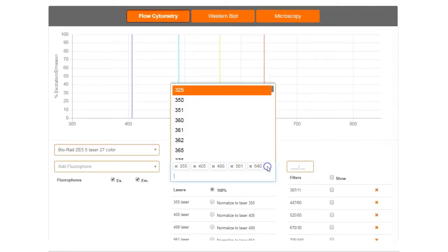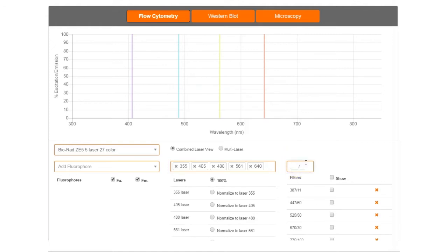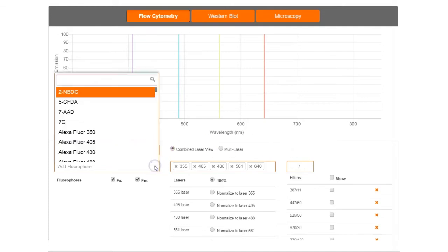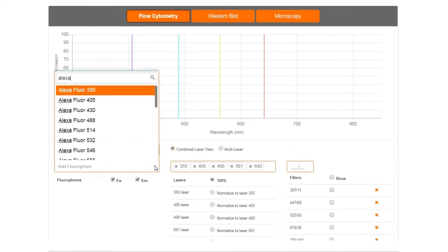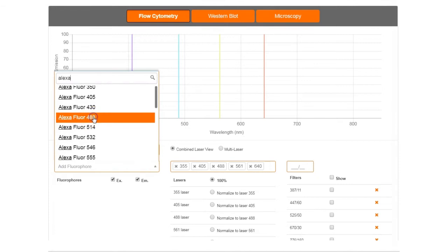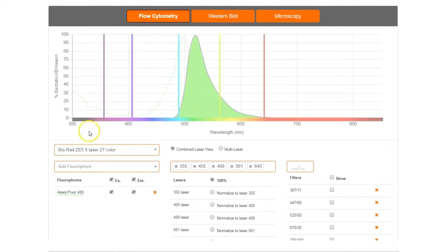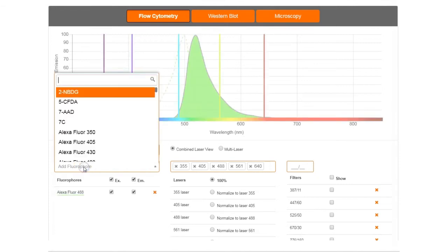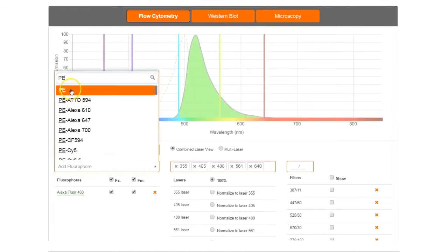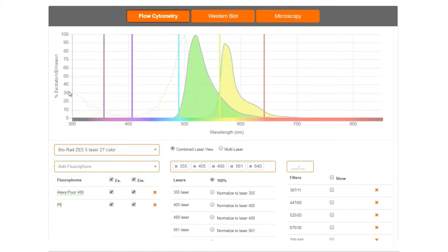Select any lasers or filters that you wish to include. Choose your fluorophore from the preloaded list to visualize the excitation and emission spectra. Add any additional fluorophores to check your chosen fluorophore compatibility.